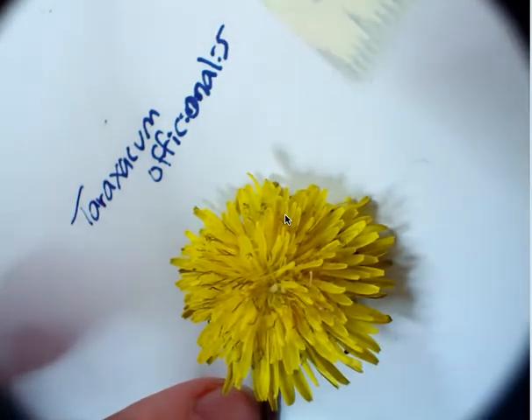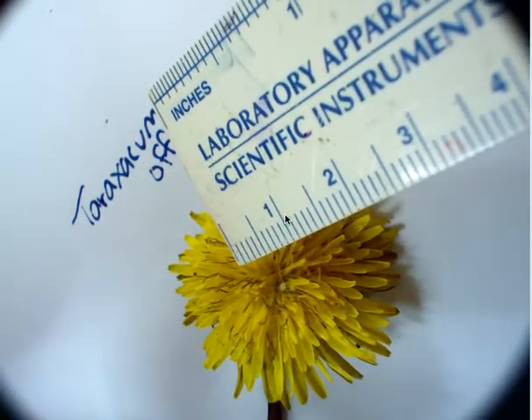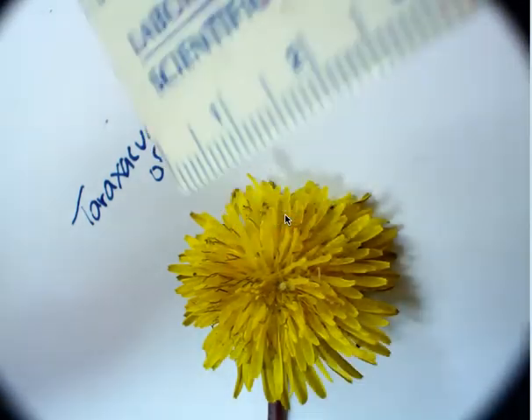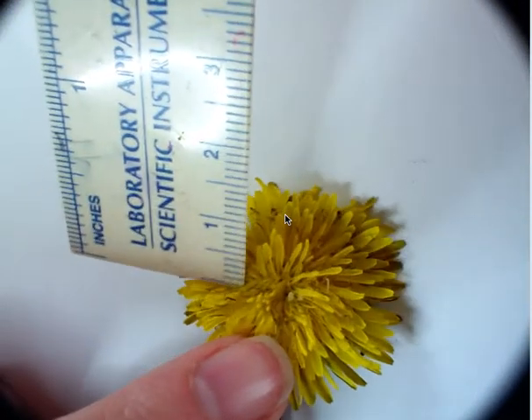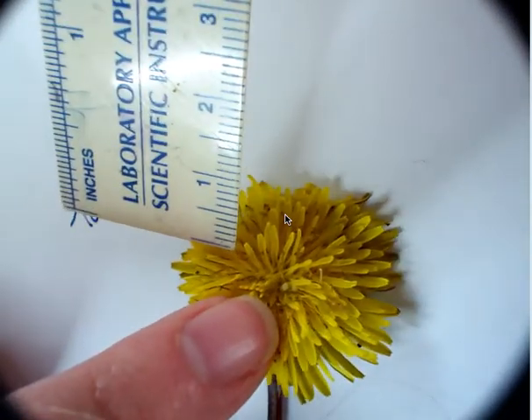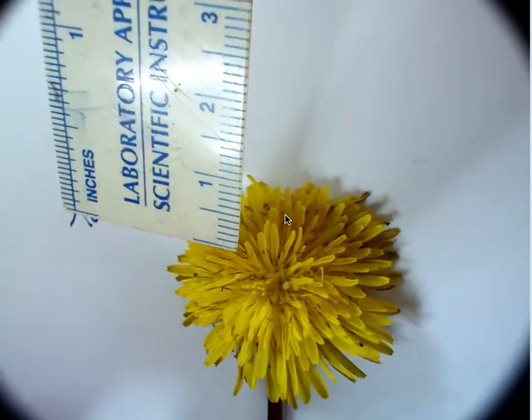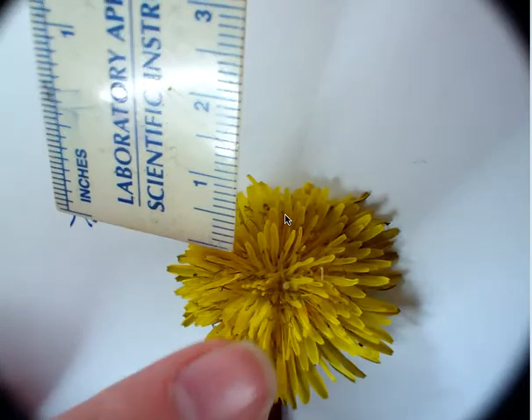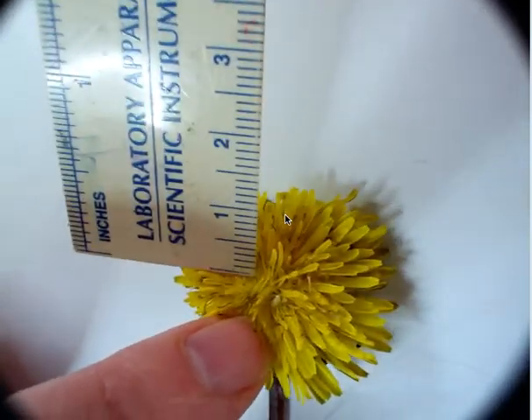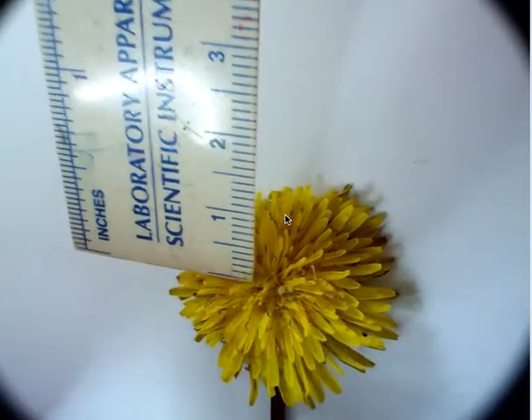Each of these little dark fibers on here — that's an anther. The anther length looks to be about a fourth of a millimeter. I'm just looking at the tip of these; that's where the actual pollen is. And then the entire stamen is about a half a centimeter long.